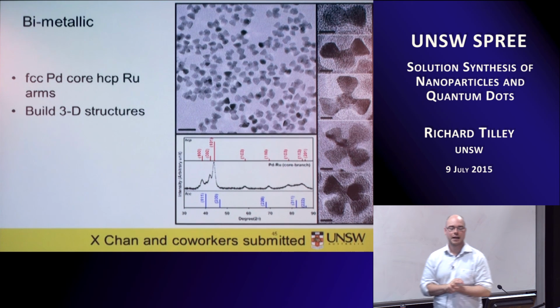Yeah, certainly the surfactants we choose won't react with lithium aluminium hydride, but sometimes we use a surfactant called oleylamine, which has a carbon double bond in it. And sometimes we do wonder, particularly if we're doing these experiments in the hydrogen atmosphere, whether, for example, you're reducing that double bond. But we haven't particularly noticed too many reactions in terms of the surfactants. Yeah.